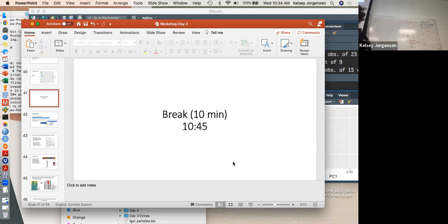So, I don't have the file, it said it's been written to CH7 pruned, prune in and prune out. This is my day 2. Yes, but the file that you put into the Excel sheet, the dot. Oh, so you want to do the second command. So what was the second line?